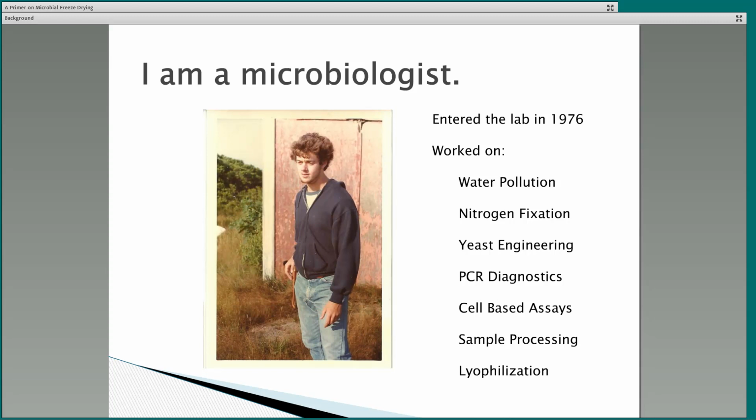Back in graduate school when I was working with yeast, I used to receive cultures from a number of institutions around the country, and they'd always come in freeze-dried, so I never really did it myself, but I always used to get the samples and have to work with them. That was my first exposure to it, and that's actually helped me later on when we started developing some of our products for that. So I've been doing a lot of different things, and over the past, I would say, 15 years, a fair amount of lyophilization.